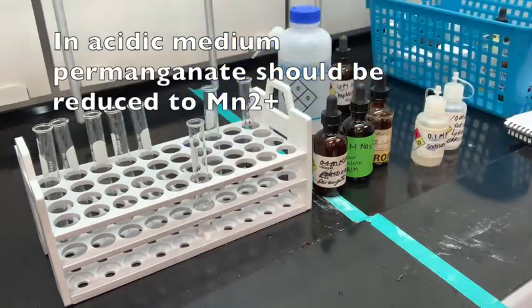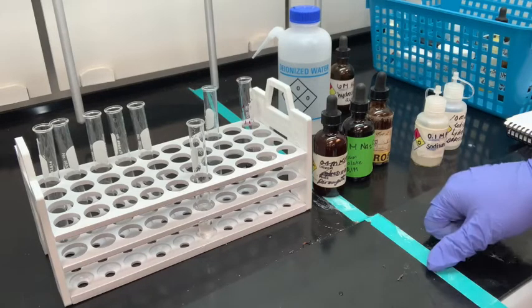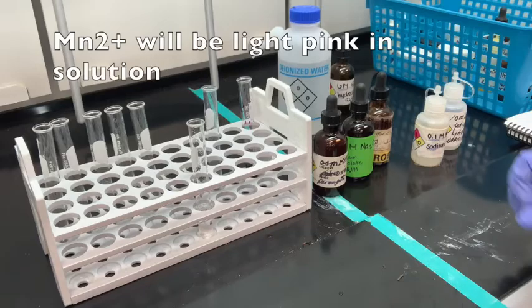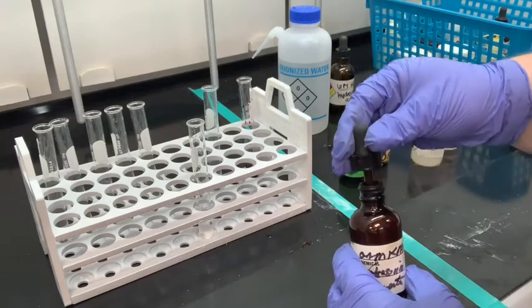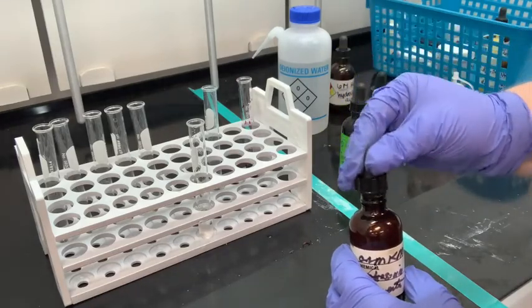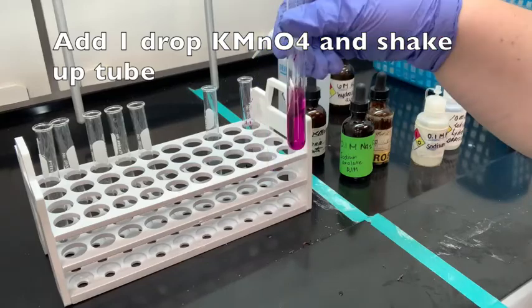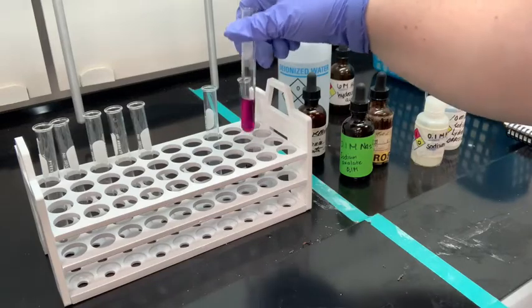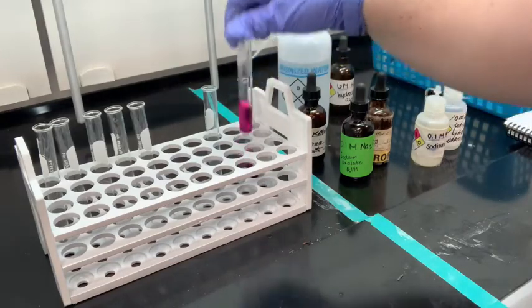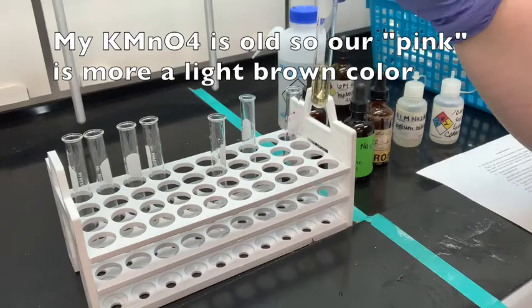In acidic medium, which is our sulfuric acid, the potassium permanganate should be reduced to the manganese 2-plus ion, which has a light pink color. After adding the acid, we're going to add one drop of potassium permanganate and let it react. We're going to move on to the next reaction and come back to check if it turns light pink.